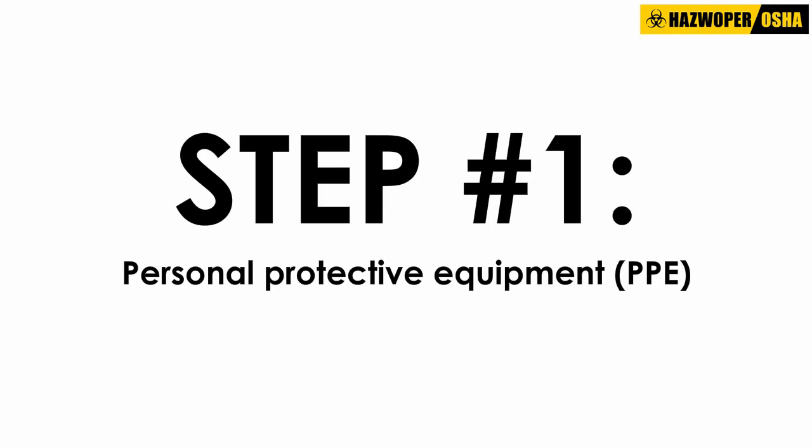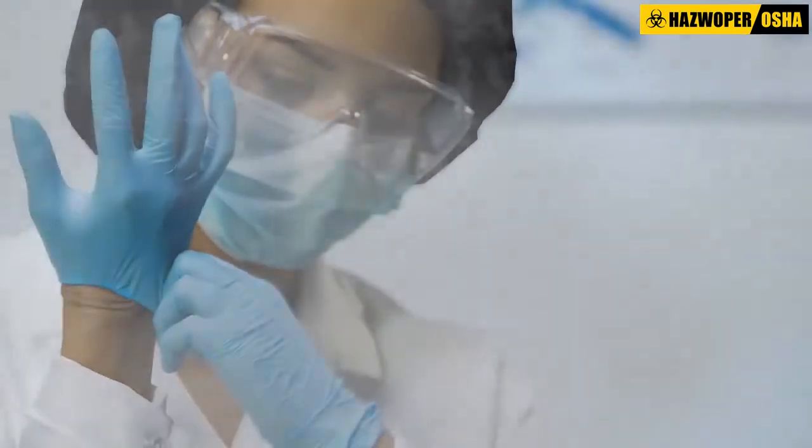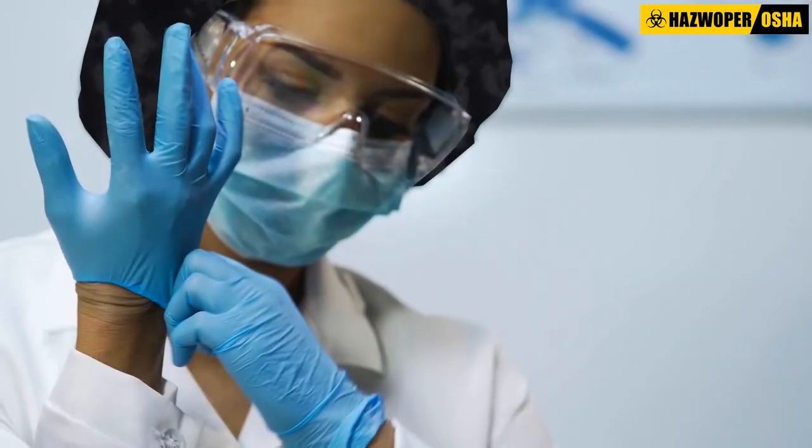Step 1: Personal Protective Equipment (PPE). Prior to beginning the cleanup process, don a pair of protective gloves and safety goggles.